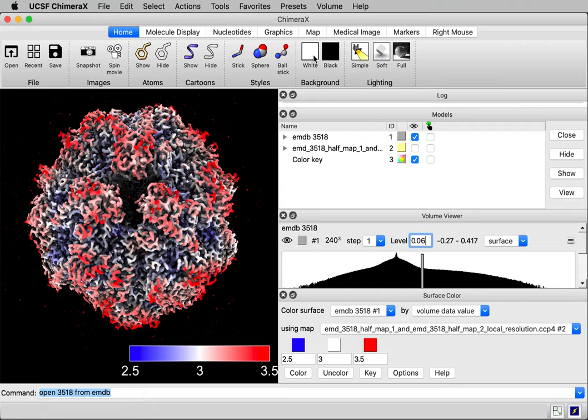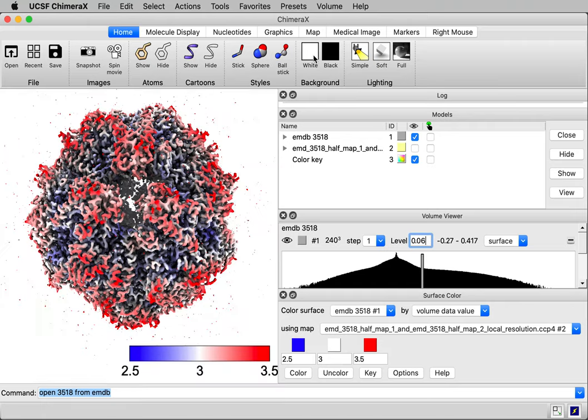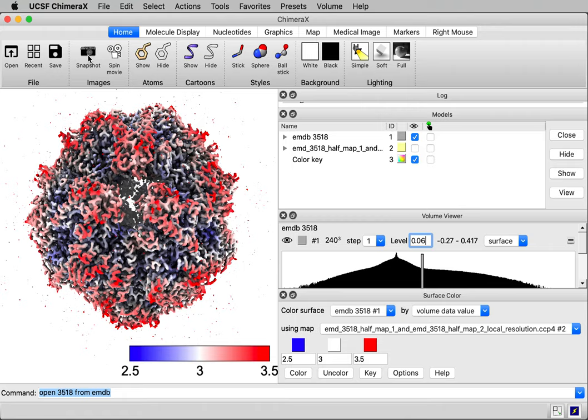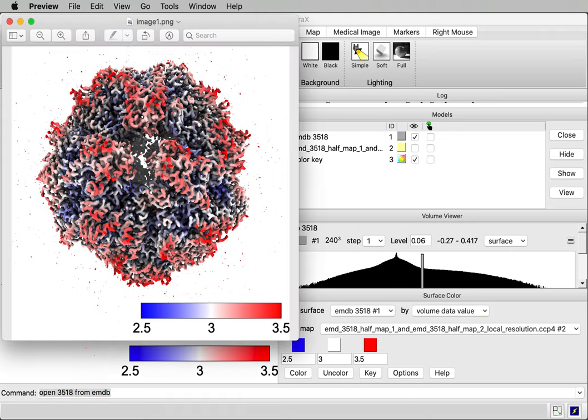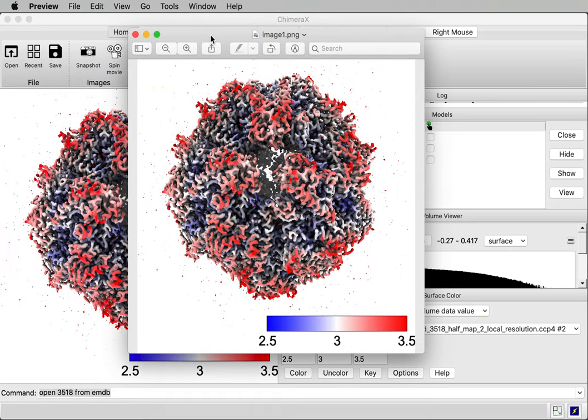All right, and maybe I'll make the background color white if I wanted to save an image. And I could save the image by clicking the snapshot button on the toolbar. That just dropped the image on my desktop. Here's what it looks like.